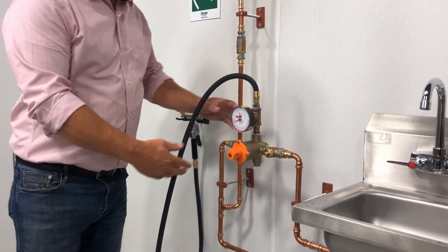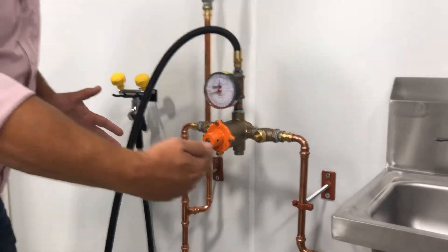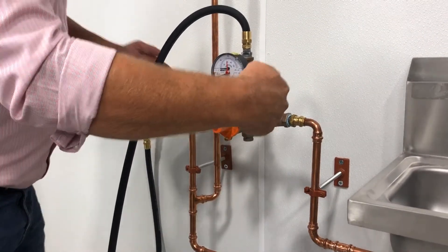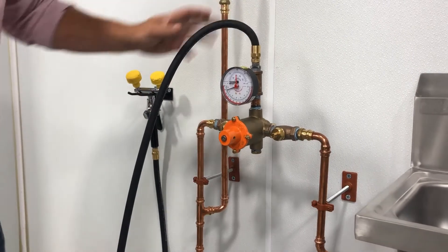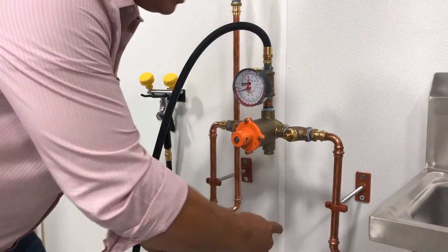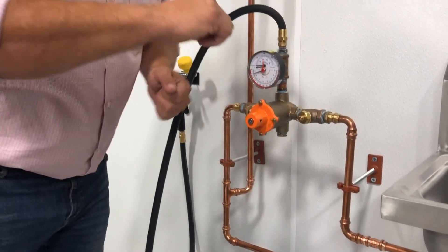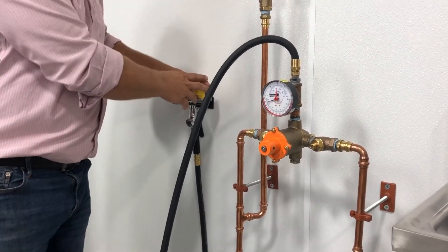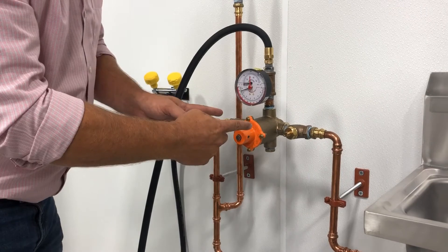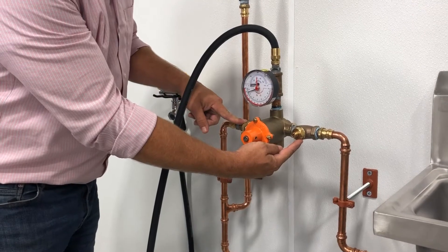Now let's talk about the installation of our ASSE 1071 blending valve. What this valve is doing is taking our extremely cold water and our extremely hot water, bringing them together and blending them to send it to our eyewash station between 60 and 100 degrees. One thing you're going to notice is I don't have any ball valves in this line — you don't want those in the line to make sure that somebody can't come over and turn them off, deeming this unusable. It does have service check valves right here, and if you need to shut these off to maintain or rebuild the valve, these are the only valves you're going to want to have in the system.